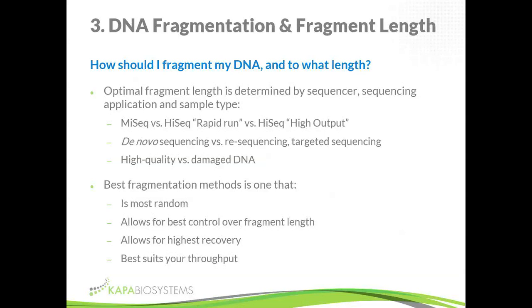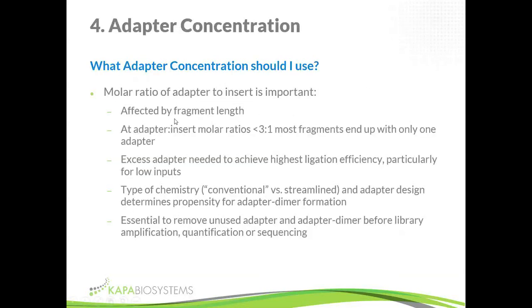Okay, so this brings us to the next one, which is adapter concentration. Now, adapter concentration, again, in a lot of protocols is fixed. If input is fixed, if you're always going to start library construction with 100 nanograms or a microgram, just use the same adapter concentration. Again, because we support different inputs for different applications and sample types with our kits, adapter concentration is important.